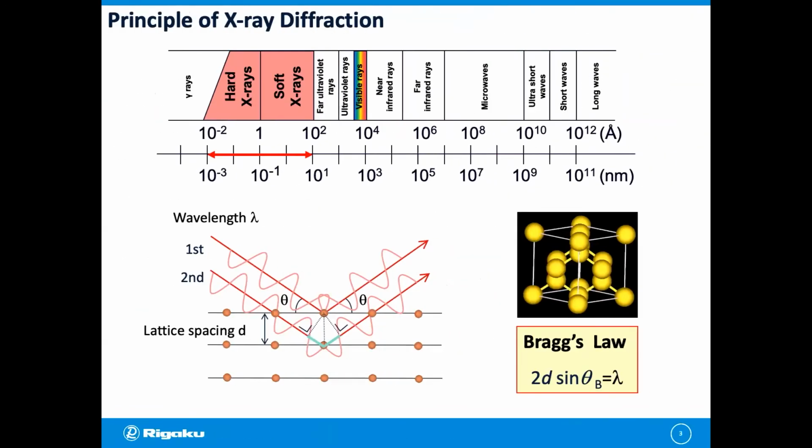As is well known, X-ray was discovered by Röntgen in 1895. X-rays are a form of electromagnetic radiation with wavelengths of 0.01 to 100 angstrom. A crystal is characterized by the periodic arrangement of atoms, ions, or molecules in three dimensions. X-ray diffraction is a technique of observing crystal structure information. It occurs when X-rays are incident on a crystal and Bragg's law is satisfied. X-ray topography uses these methods to observe imaging data.